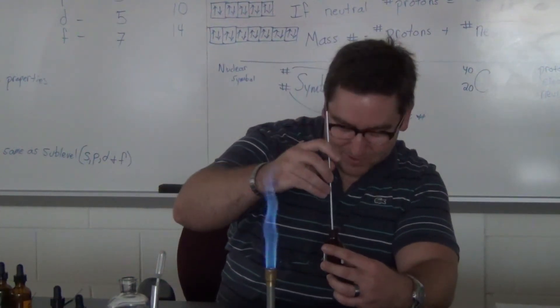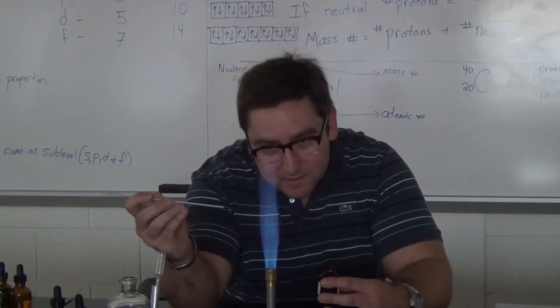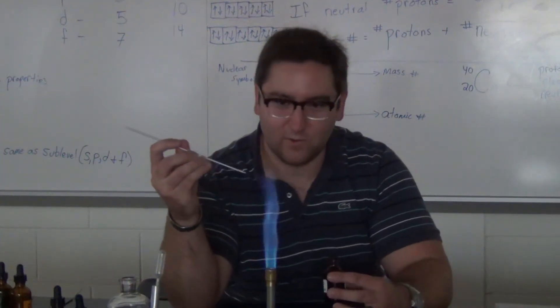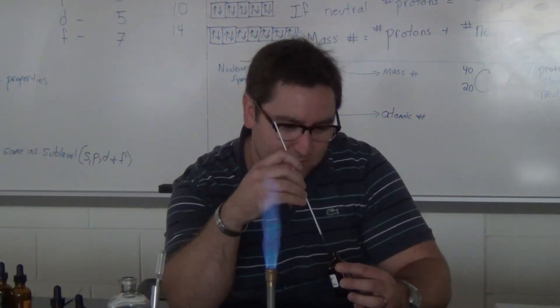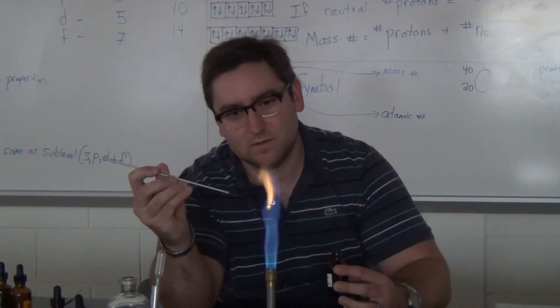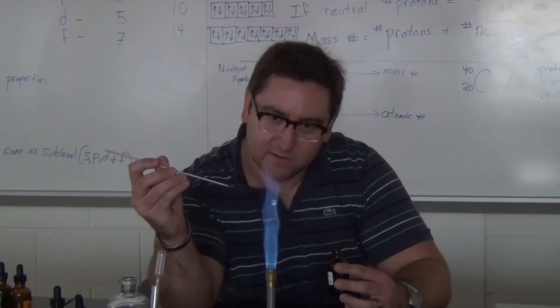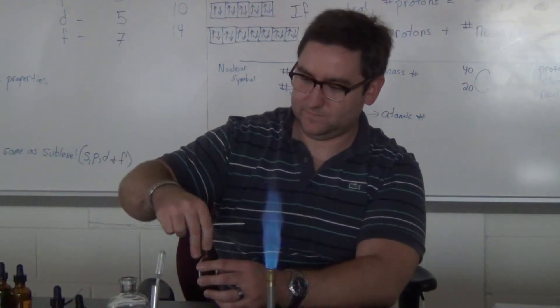So we're on barium chloride. It's very quick — I'll try to... The orange was after it already burned off, so that first color you see — see if you see that yellow. Did everyone see that? It's kind of like a yellow-green. It's very quick.